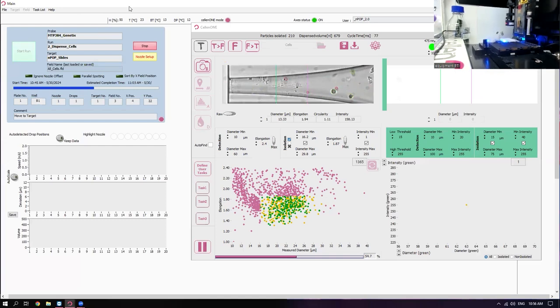When the nozzle comes back from the deck, we take an image, we identify where the nozzle is in that image, and then we look in that position relative to where that nozzle is to essentially look inside of the nozzle again and see the cells. And so you do see a slight shaking or these kind of spots that are on the camera.